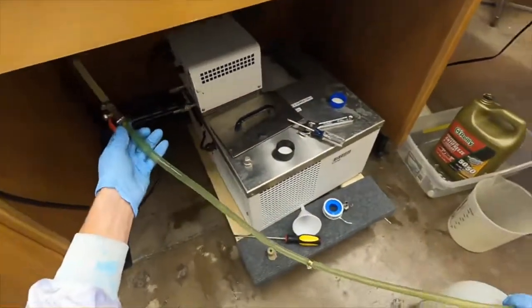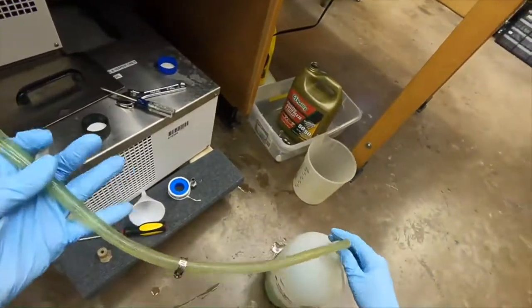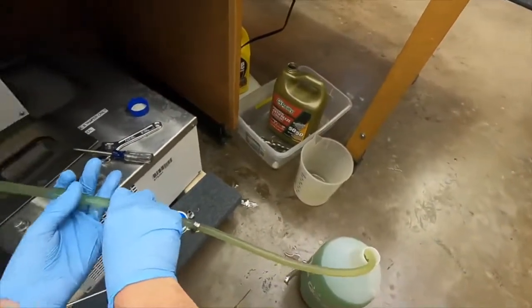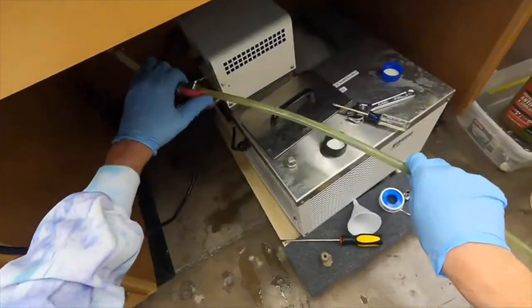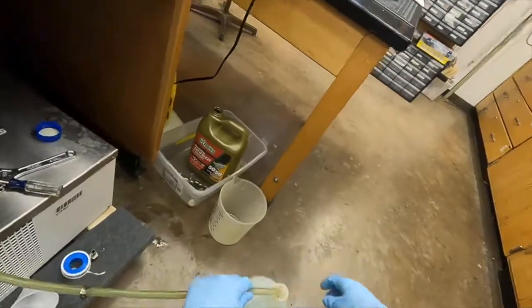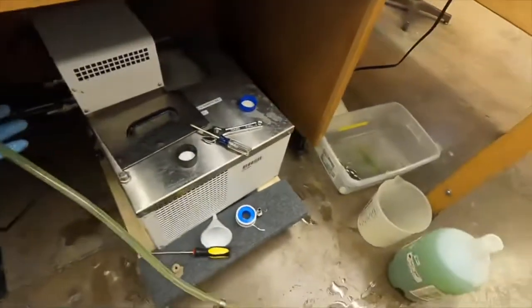Then you open this valve up and this should just start draining. Once this is about full, you just clamp off this valve again and then switch to the other bucket, and then you just do the same thing until it's drained.